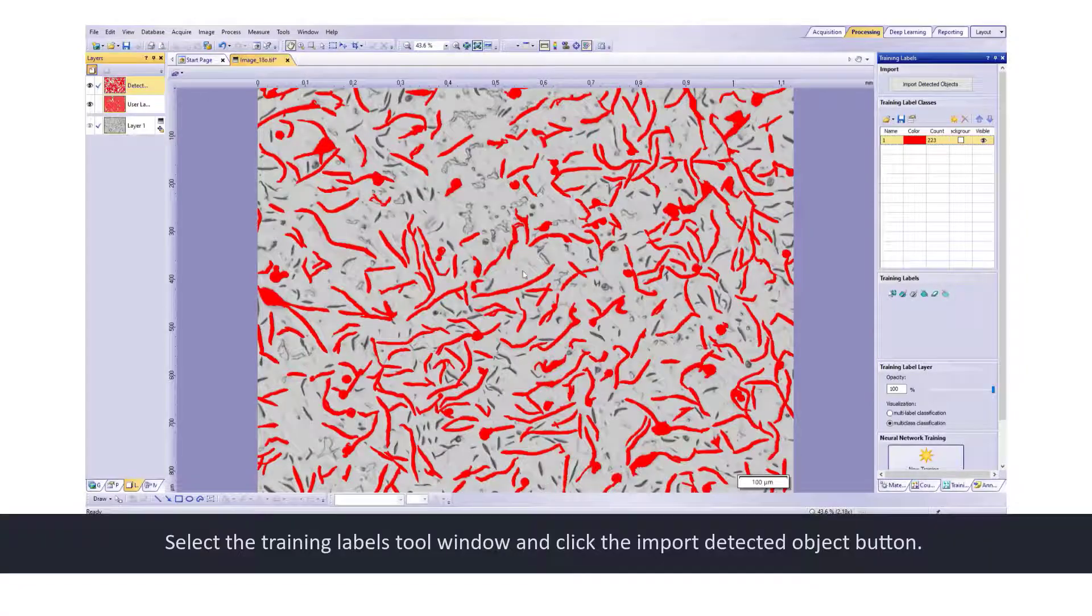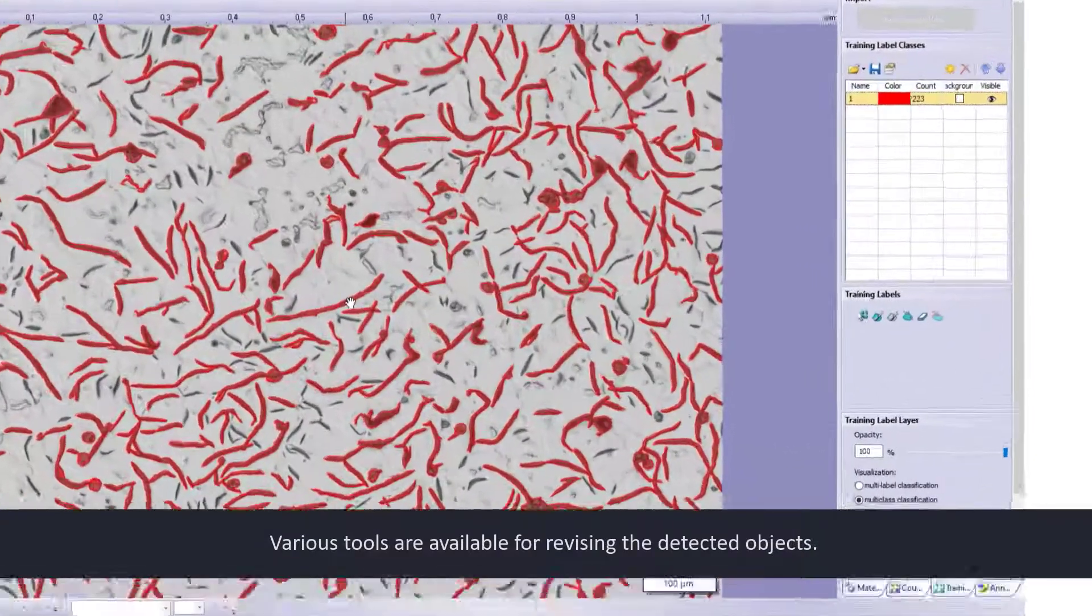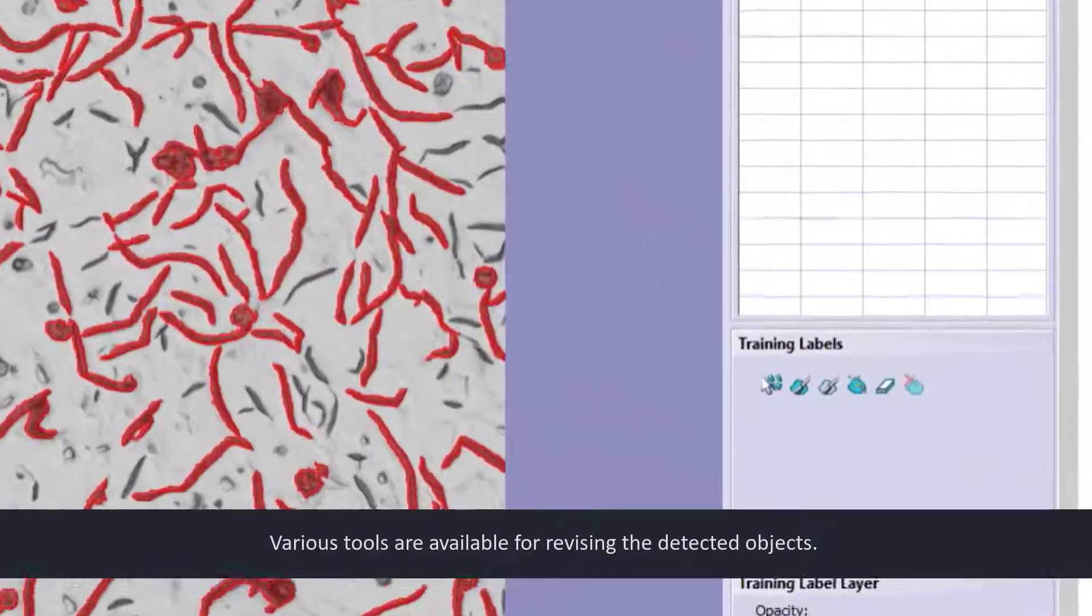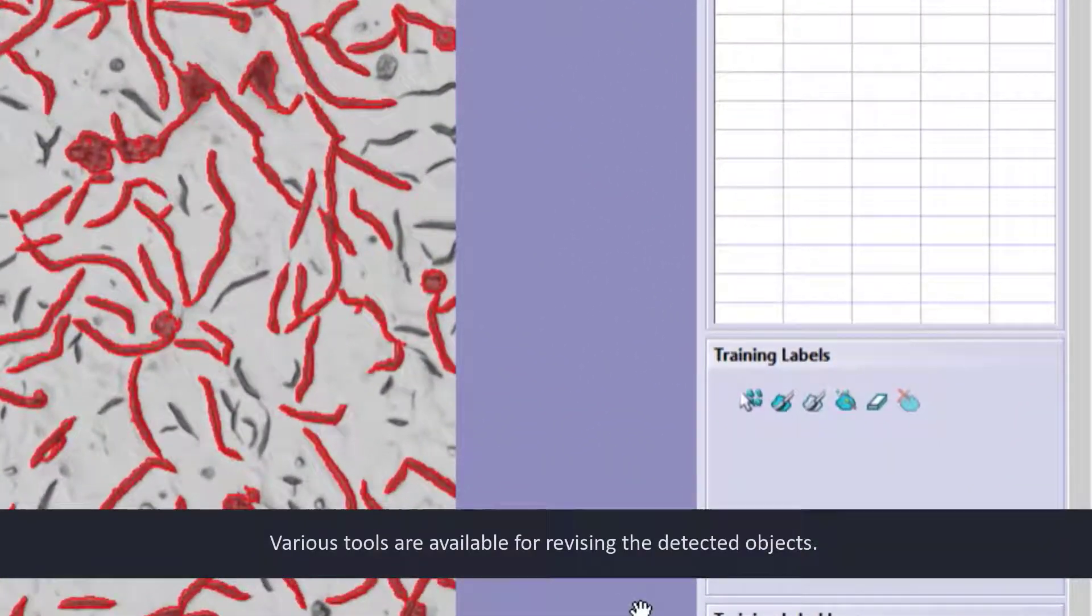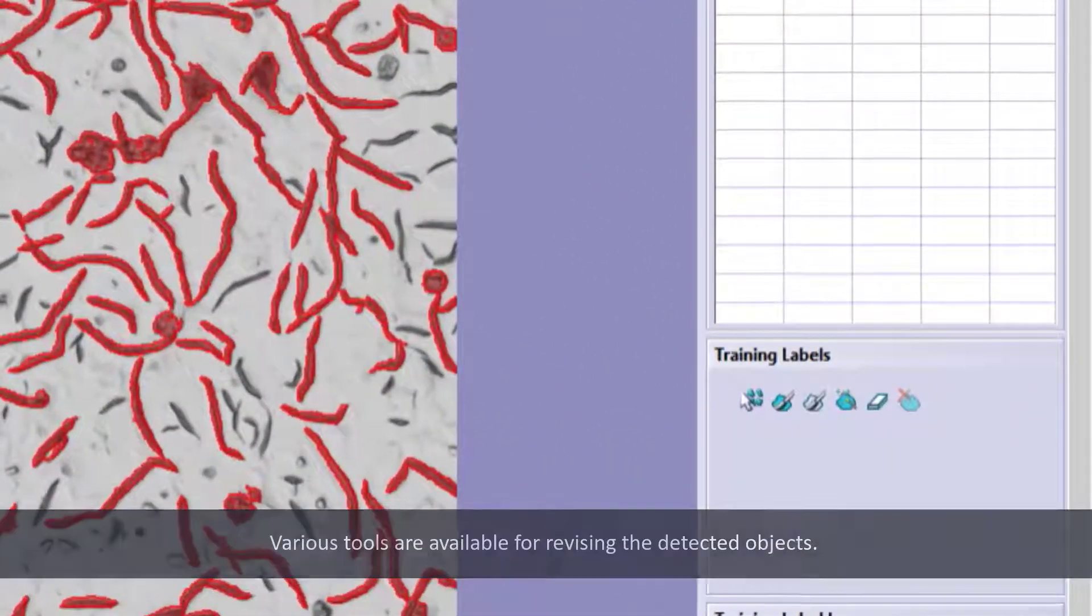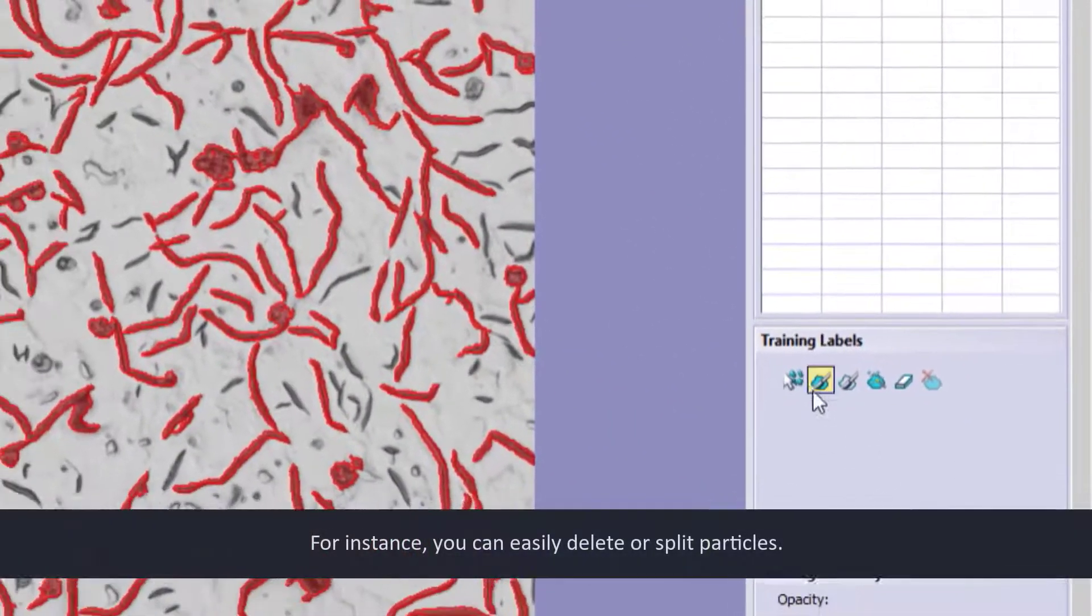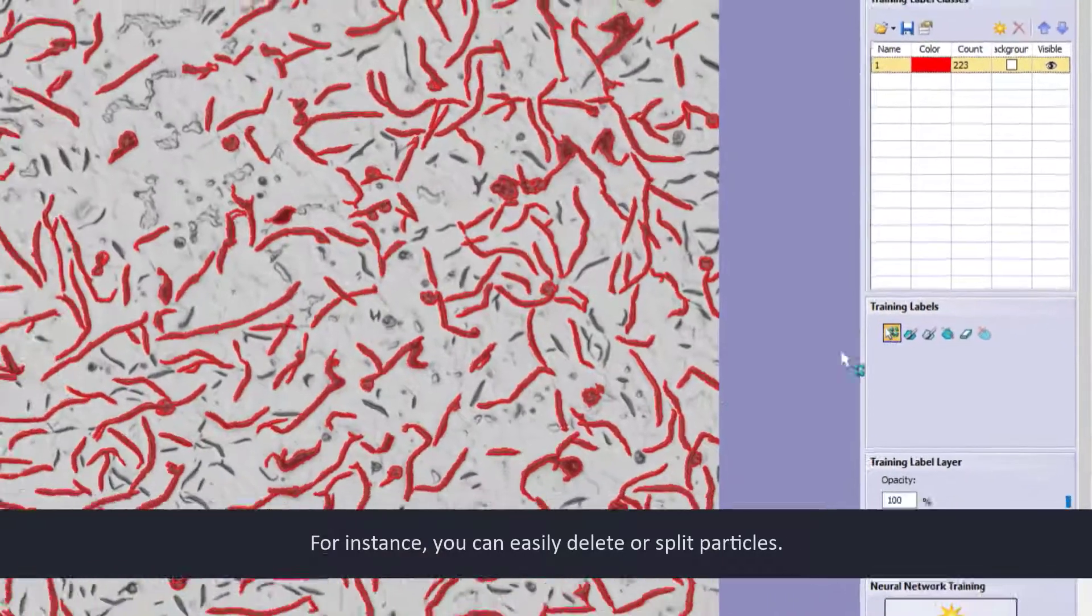Various tools are available for revising the detected objects. For instance, you can easily delete or split particles.